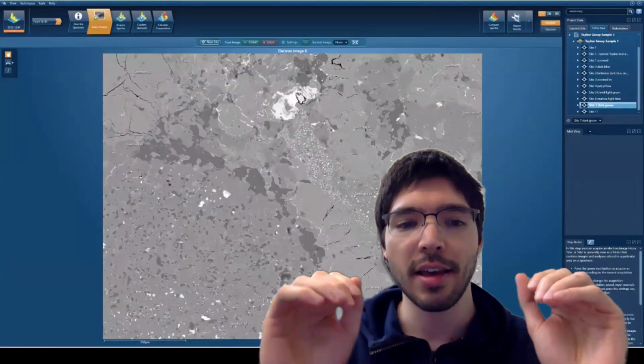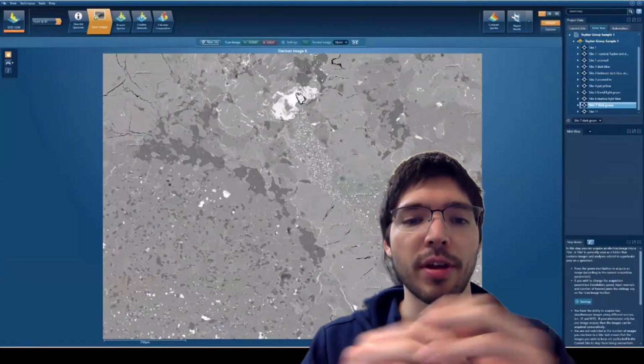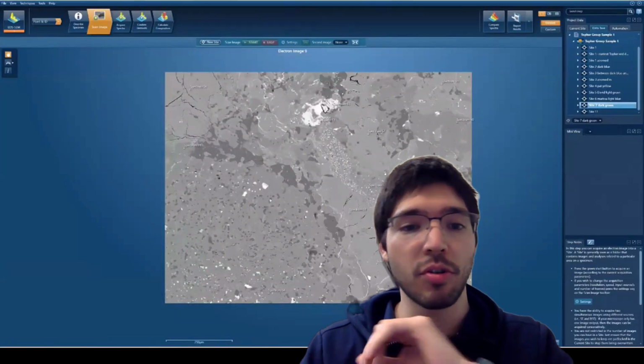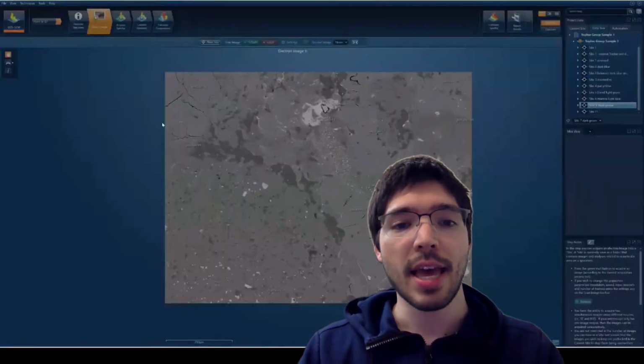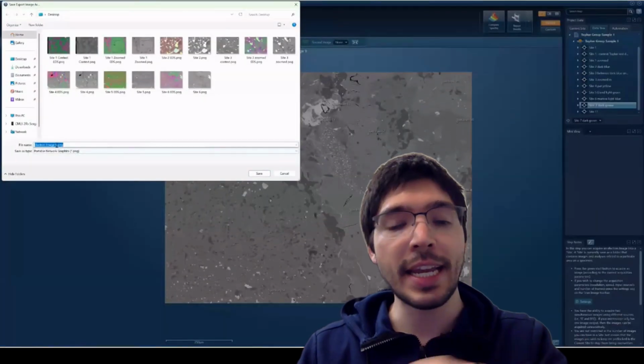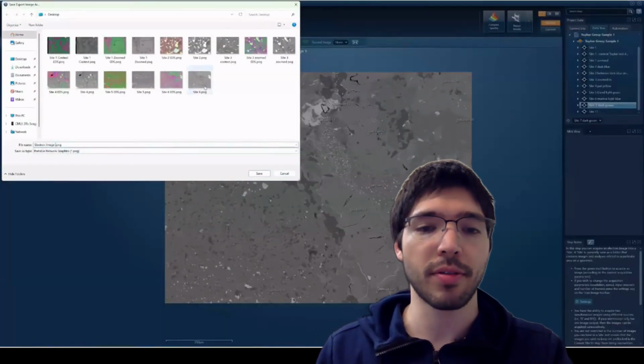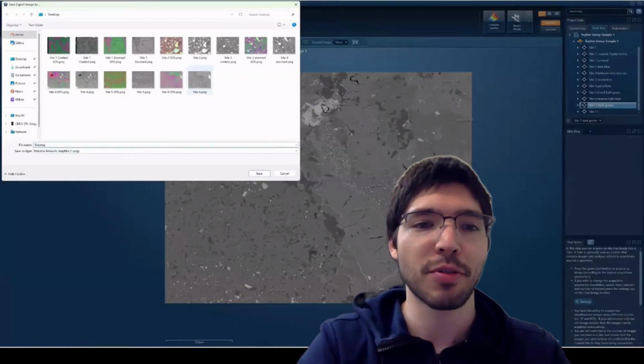We're just getting backscatter electron images for viewing textures and looking at mineral phases, the chemical maps to identify mineral phases, and the EDS spots to essentially get chemical data from the minerals. And we're just extracting all of that to a spreadsheet.